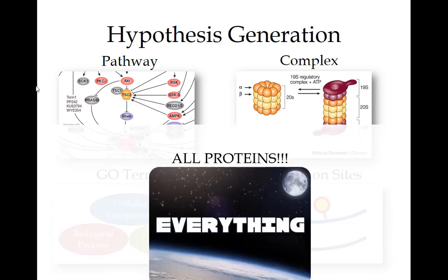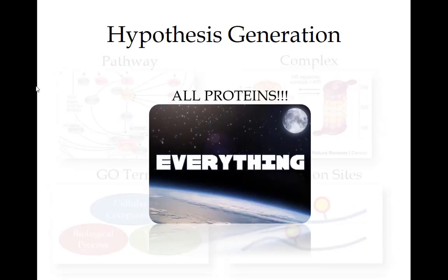Every time I tell people this, they just say, well, I want to query for everything. And I say, great. There's a problem with that though, and I generally don't recommend it. For every single one of those queries, that's a hypothesis test. So if we're trying to make detections, you're testing a hypothesis.